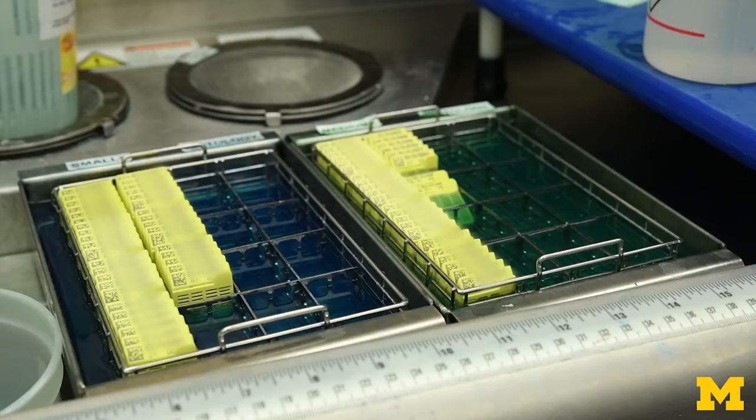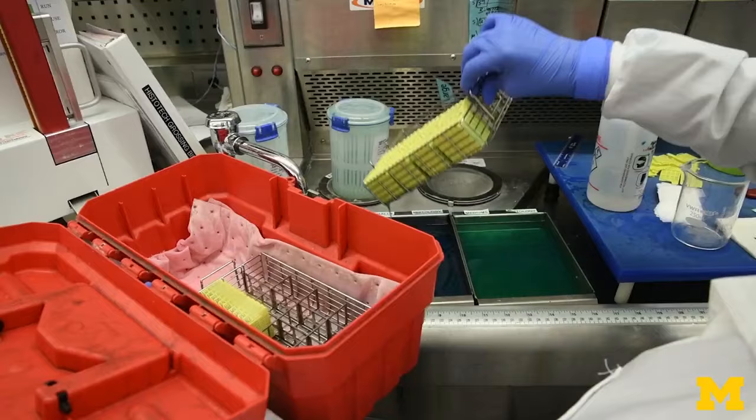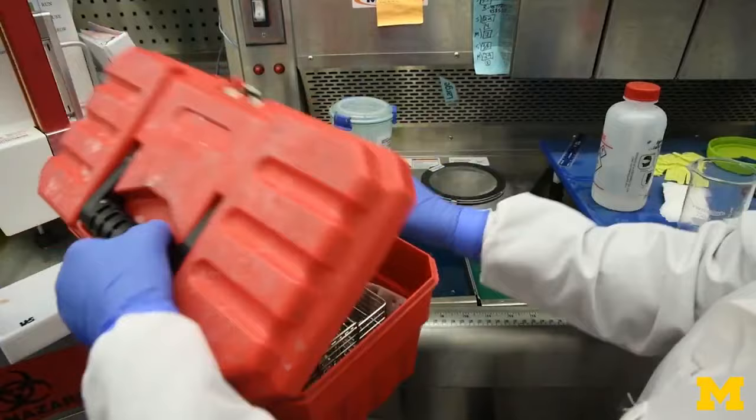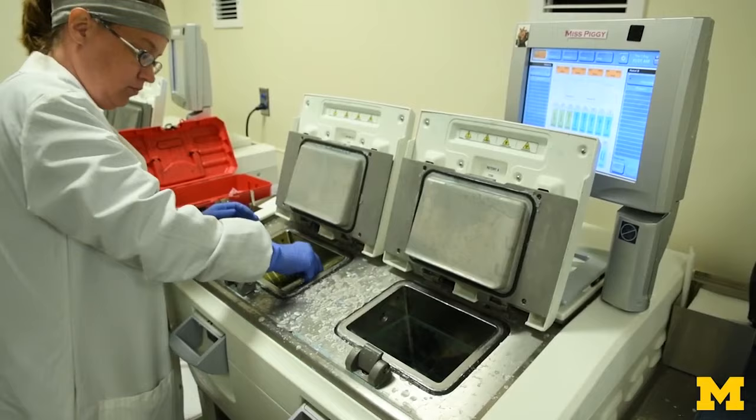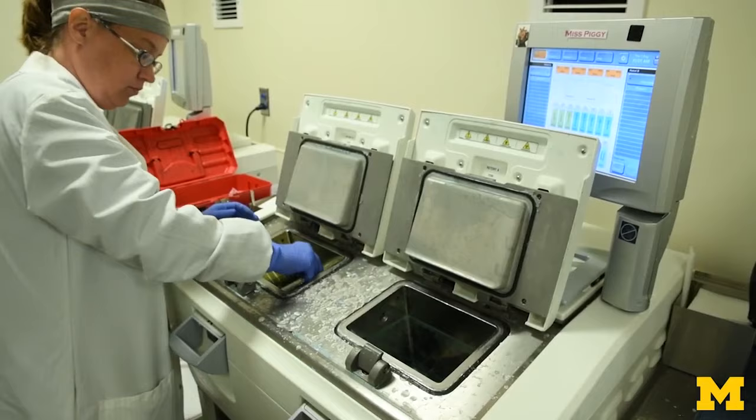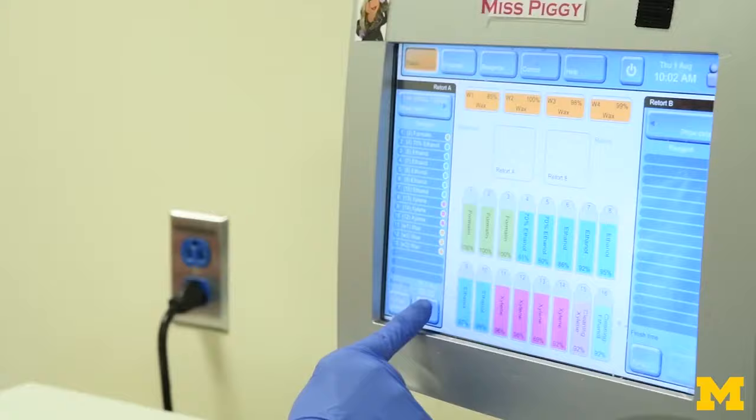The cassettes are then loaded into a tissue processor in batches. The processor dehydrates the specimen with alcohol, which effectively replaces the water in all of the cells. The alcohol is then removed by a chemical such as xylene and replaced by paraffin wax. This process transforms a piece of human tissue into a specimen that can be preserved for decades.